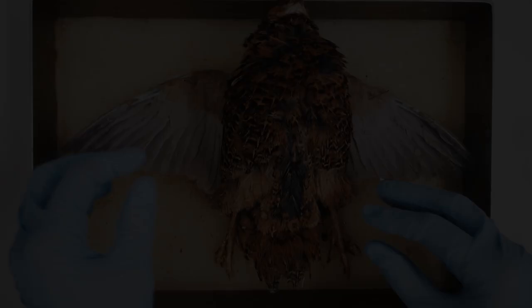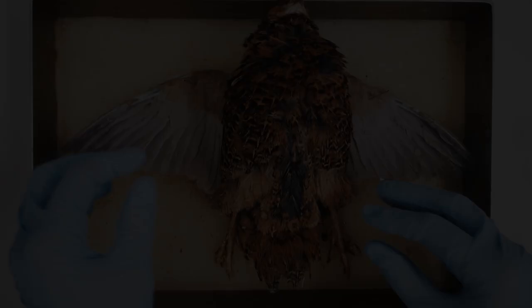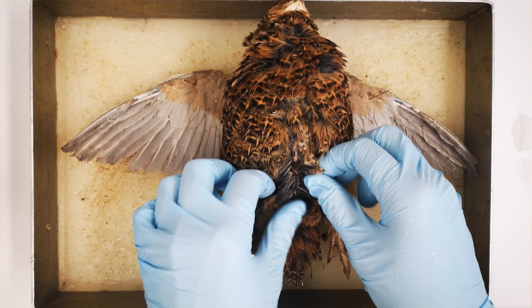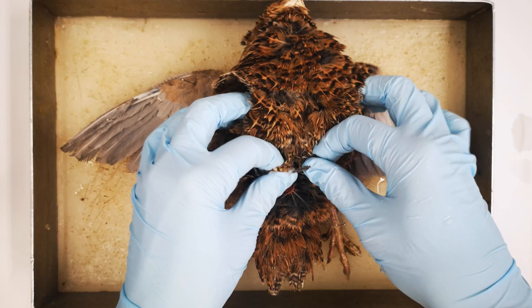For the preparation of the internal organs, the feathers must first be plucked. With the fine down feathers, it is advisable to do this underwater, as they can easily float through the air.